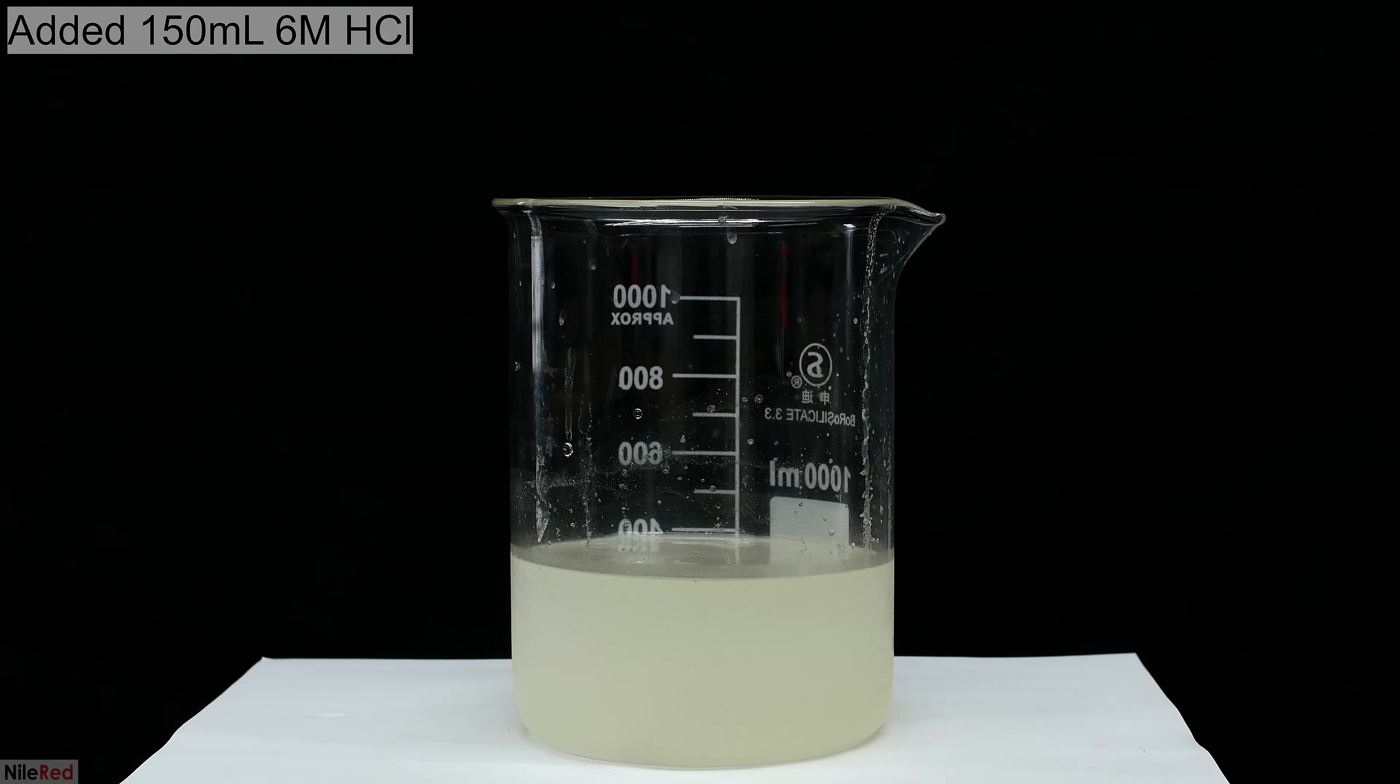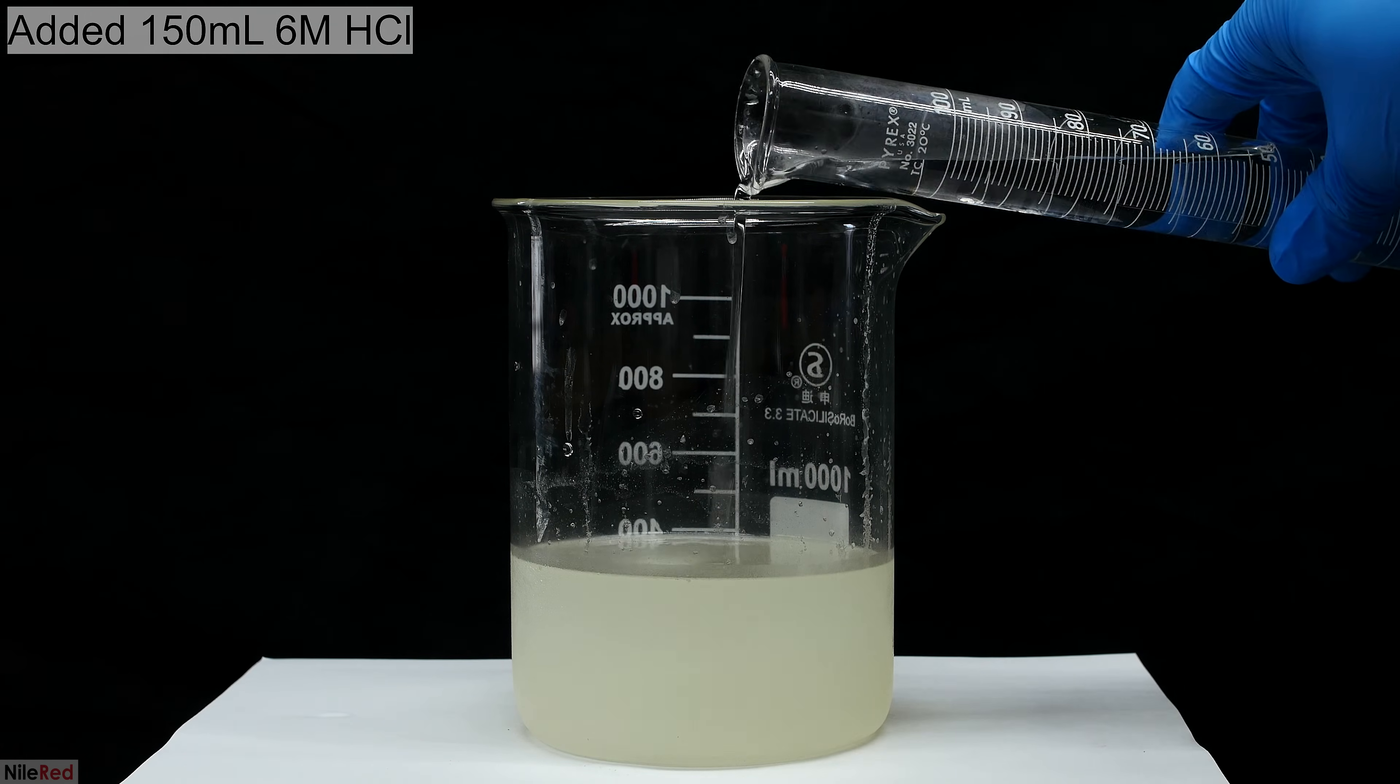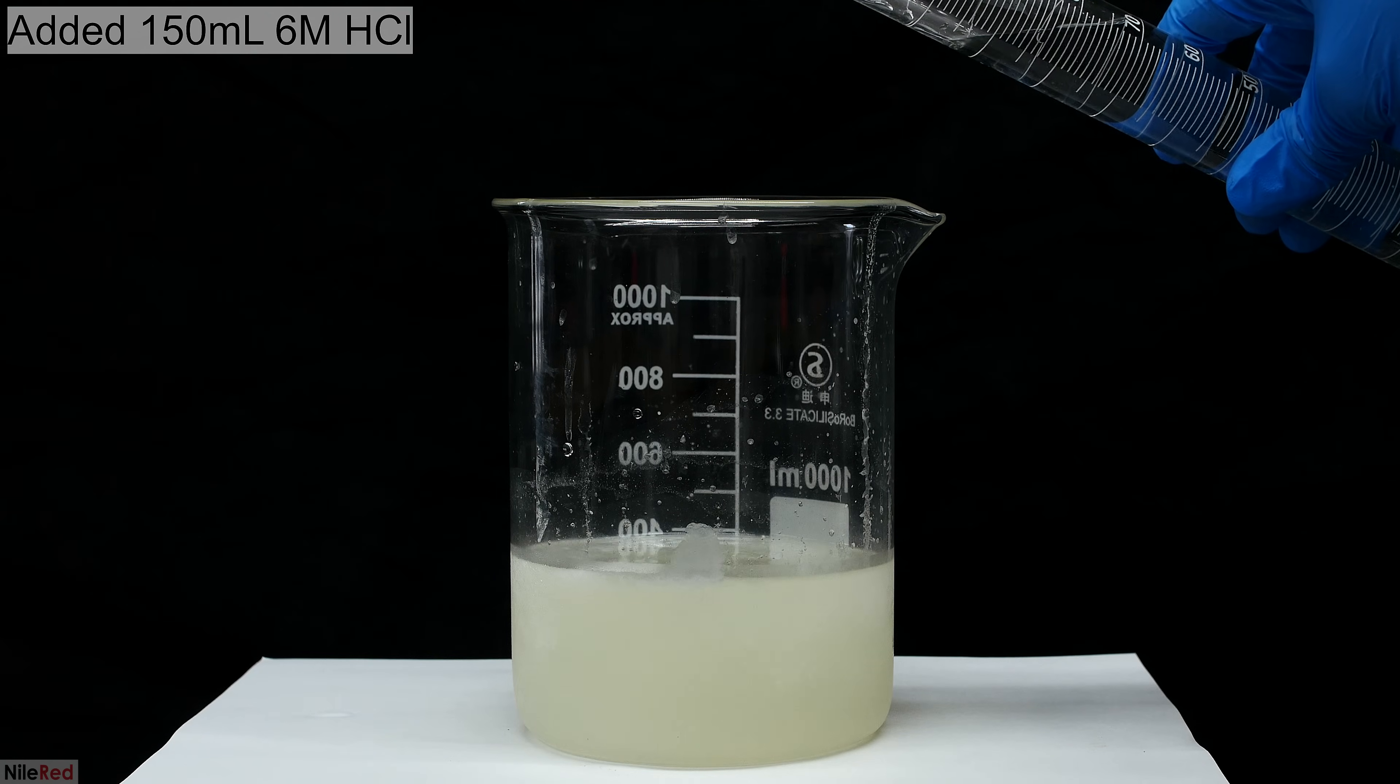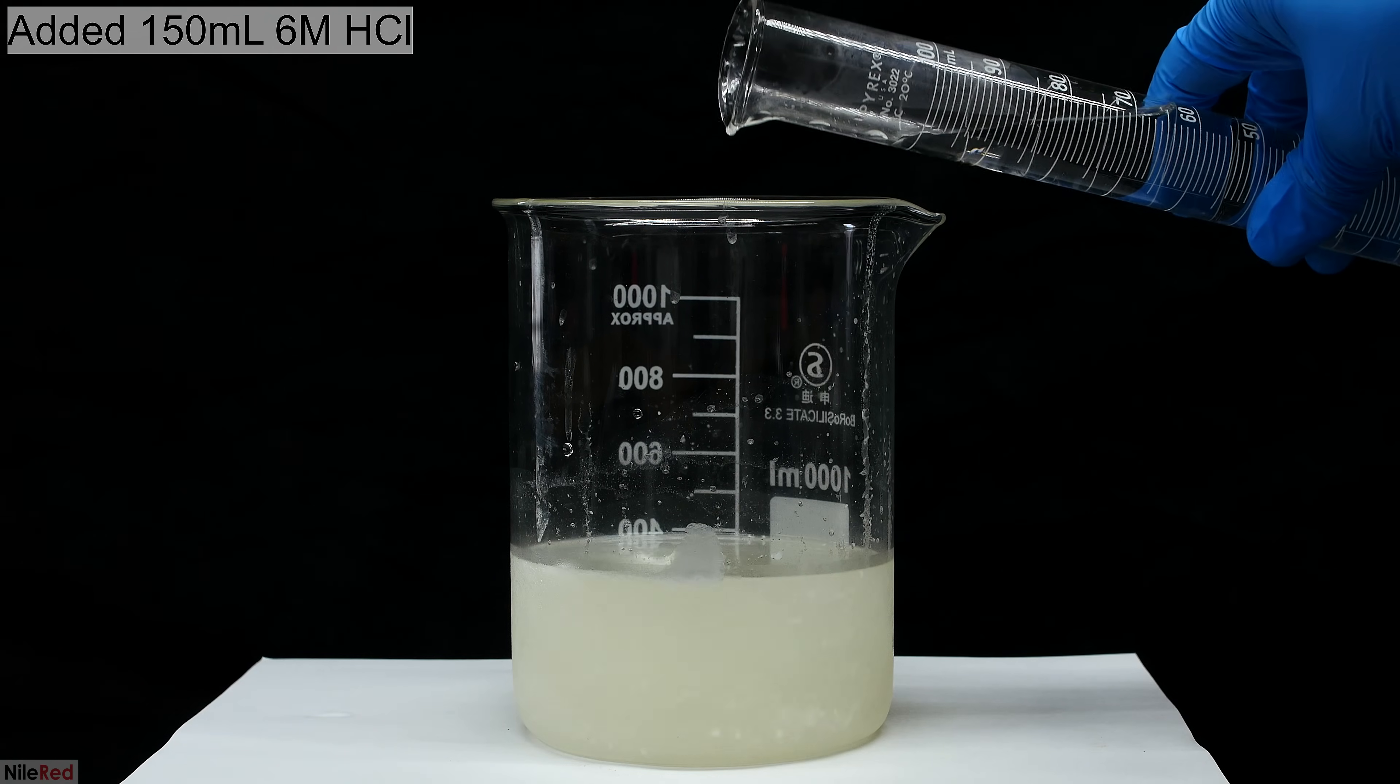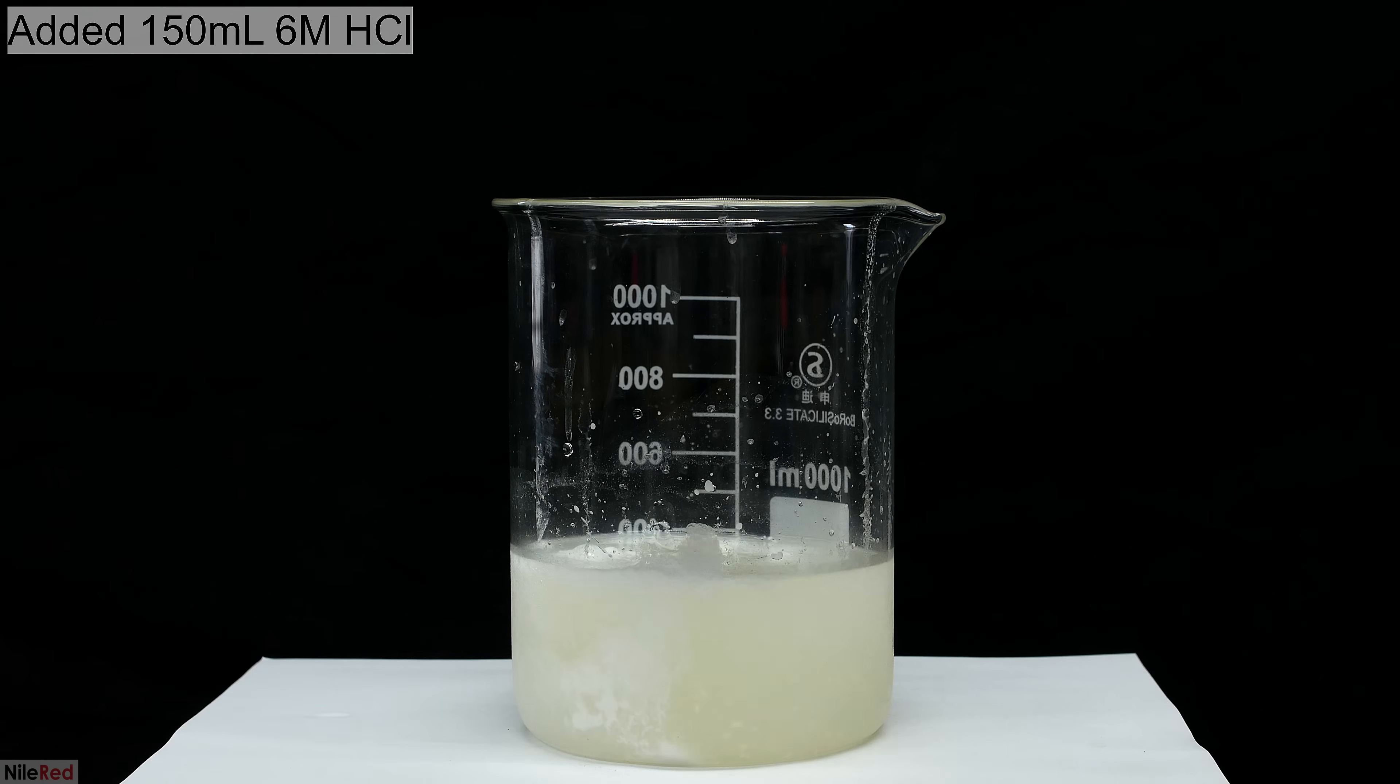To the watered down reaction mixture, I then start to add some 6 molar hydrochloric acid. The moment that the hydrochloric acid is added, you can see a white precipitate forming. The white precipitate is our desired product, trans-cinnamic acid.